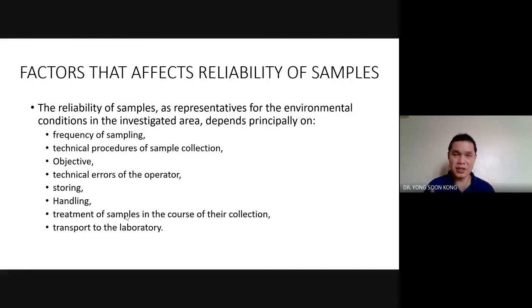How does it change? Because you put it in a bag, right? You put it inside the bag, and inside the bag, it seems like there's a lack of oxygen. Therefore, it changes. If there's a lack of oxygen, different from the sampling site, something will change. How does it change? I don't know, but it will change something. So that's why treatment there will minimize those changes. Usually this treatment will be statistical treatment.